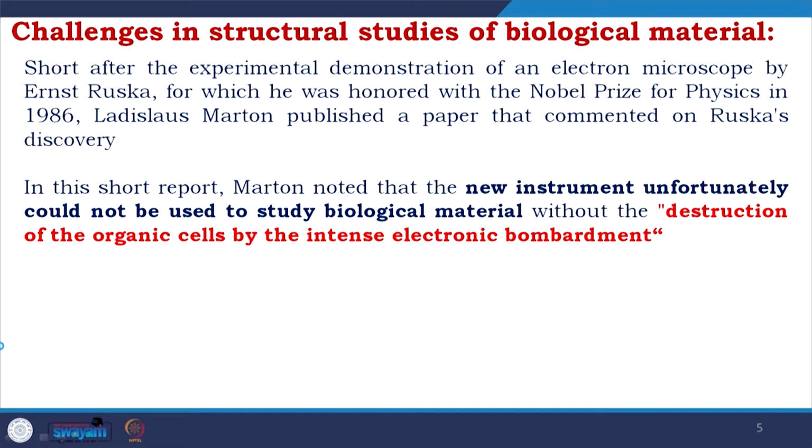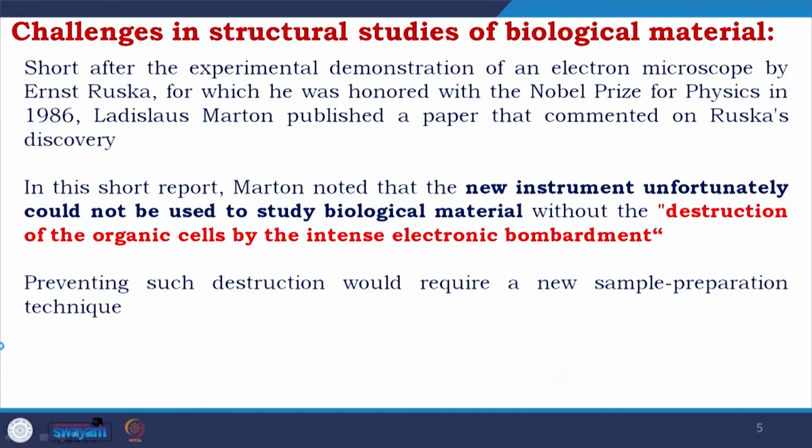So, what he is trying to convey is that with the electron bombardment, which is an integral part of the instrumentation working, it is not possible to keep biological materials intact. It will destroy the material. Preventing such destruction would require a new sample preparation technique.